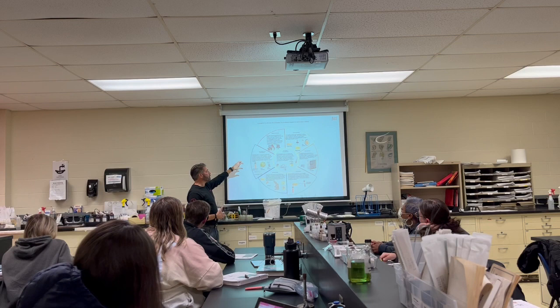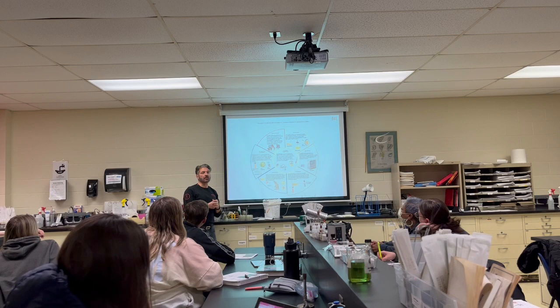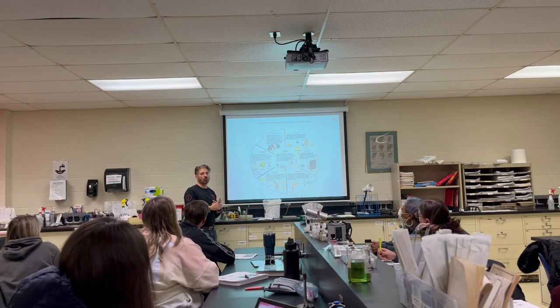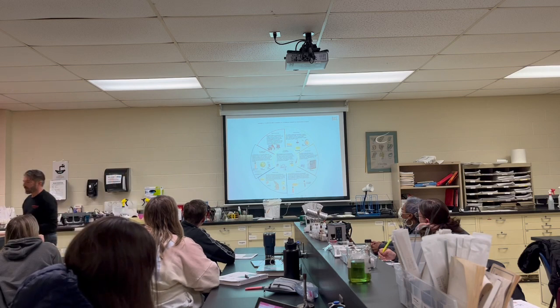Right? I'm playing with the idea of doing a urine lab in here. I'll take some different vials and I'll put different bacteria in them and some fun stuff. It'll all be fake. And then it'll be an unknown, and then you can grab it, stain it, and tell me gram-positive, gram-negative, rod, what is it, E. coli, Klebsiella, Enterobacteriaceae, or something like that. So we'll kind of make it sort of real-life-ish, if possible.